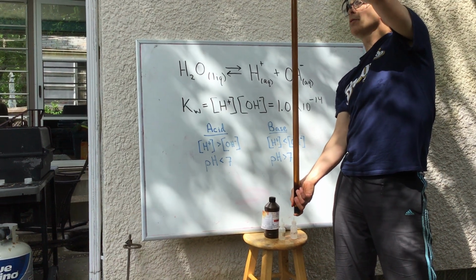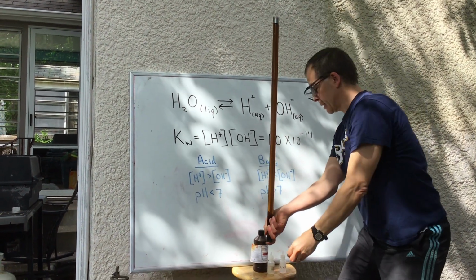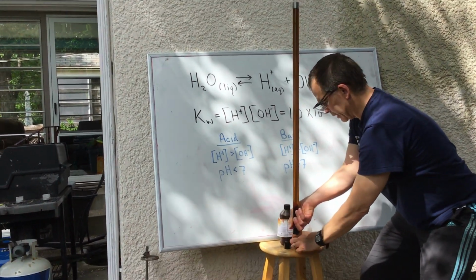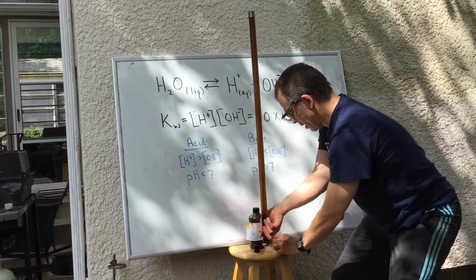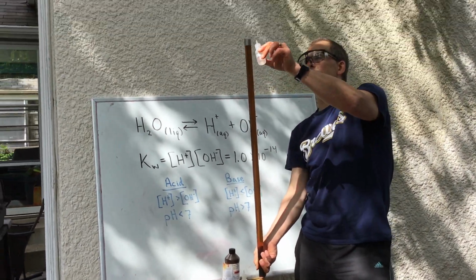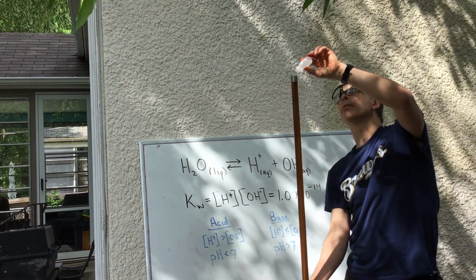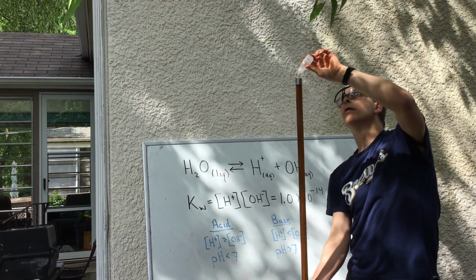All right, we're going to do a pH tube today, and I have a universal indicator in here, and it's kind of a yellowish color. I'm hoping you're able to see it out here. We got some mixed lighting, but probably better than the indoor lighting. And I'm going to add some 0.1 molar HCl to this. My tube broke, so I had to put a little duct tape on there.